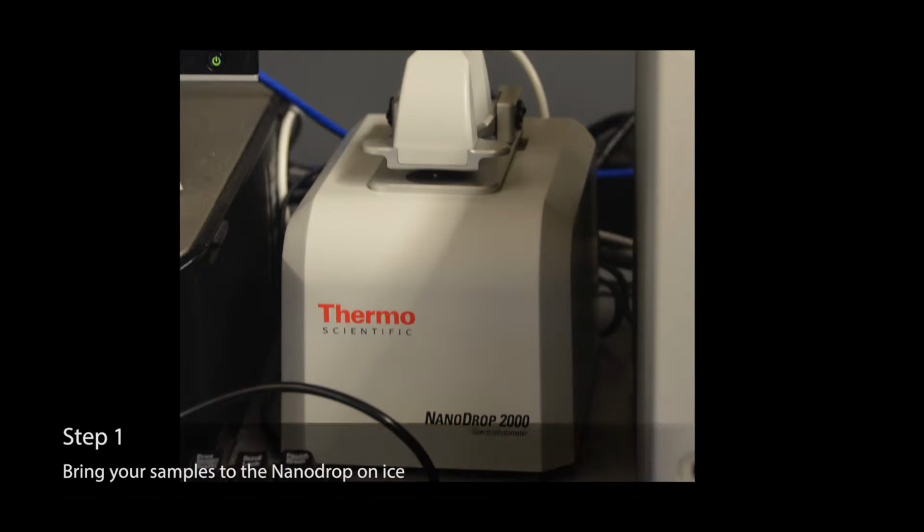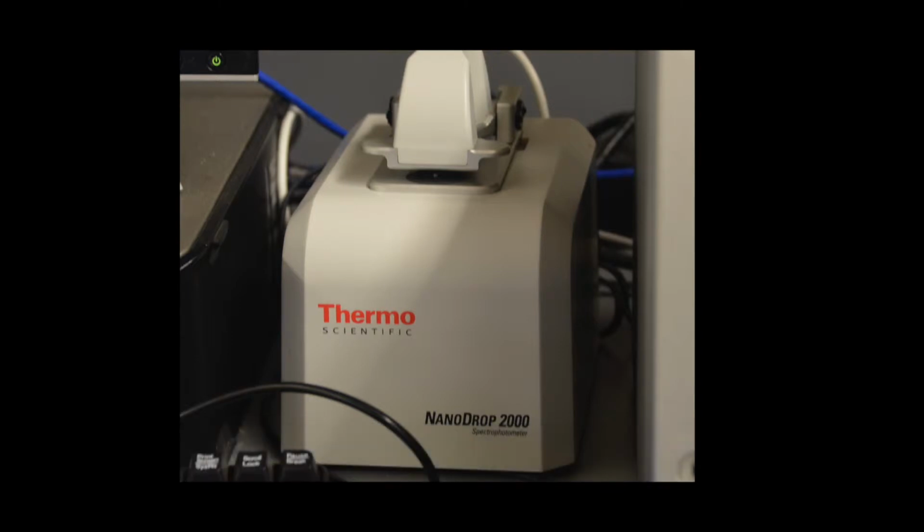The first step in the nanodrop procedure is to bring your samples to the nanodrop on ice. In addition, you should bring the solution used to elute your samples, a P10 pipetter, a box of RNase-free P10 tips, and your lab notebook.